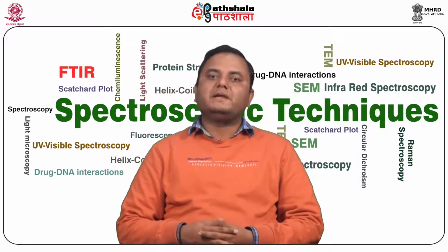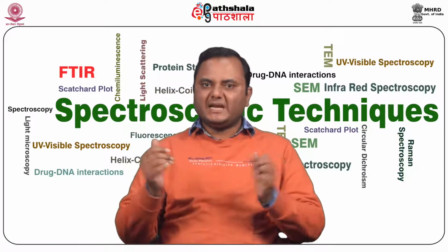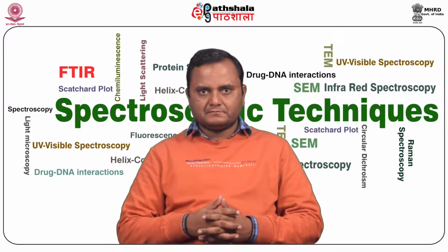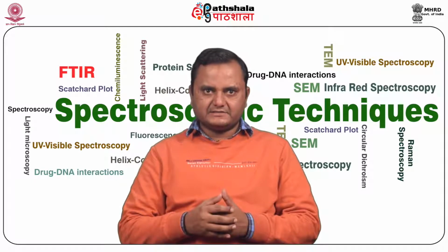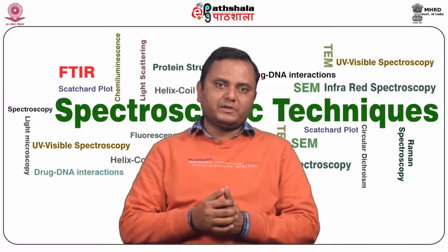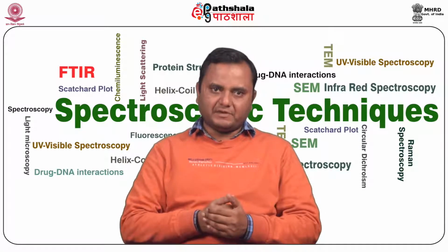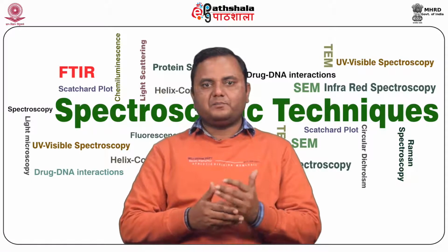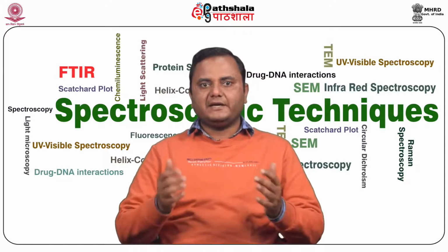Now we discuss some common applications of circular dichroism. It is most widely used for proteins and peptides to estimate the amount of secondary structure present. For estimation of secondary structure, CD is the most widely used technique, and it is also used to evaluate the conformational changes that occur in a protein under different conditions, such as a change in the molecular environment. It also measures ligand binding phenomena, with the possibility to carry out both equilibrium and kinetic experiments.